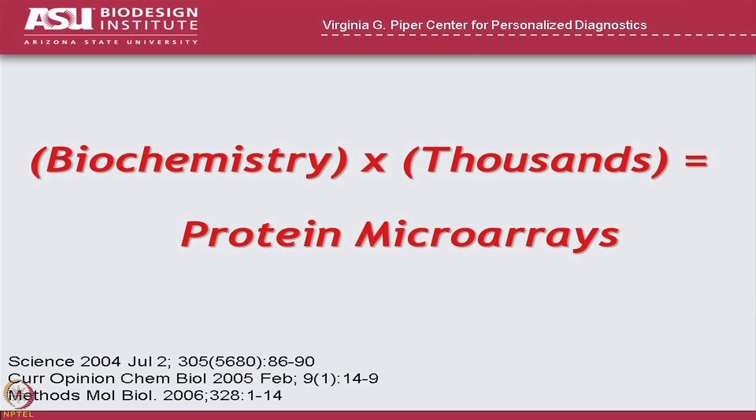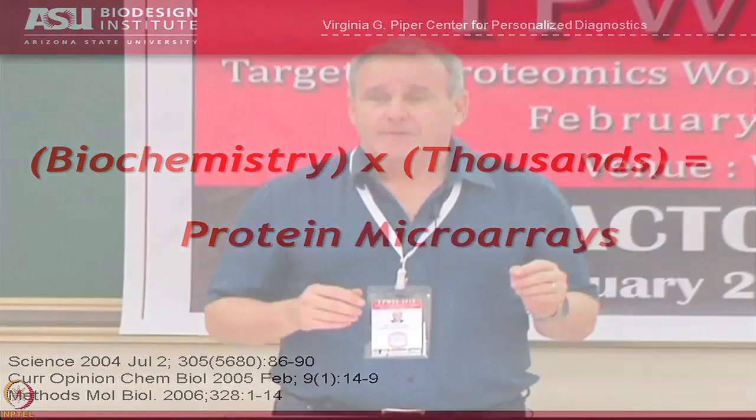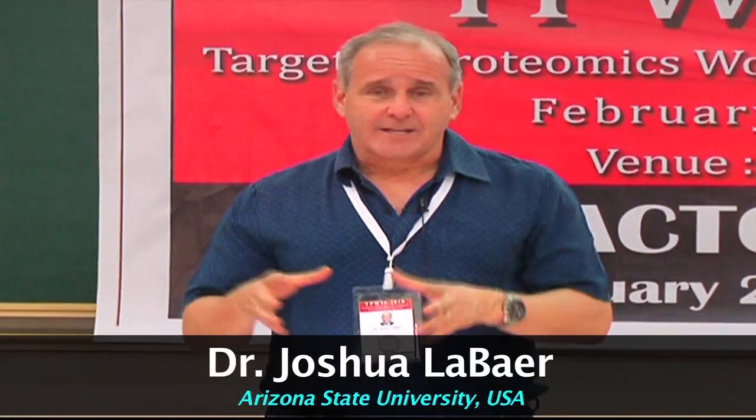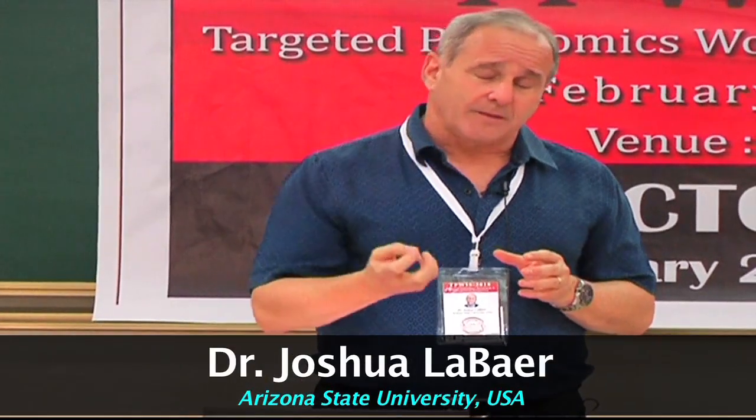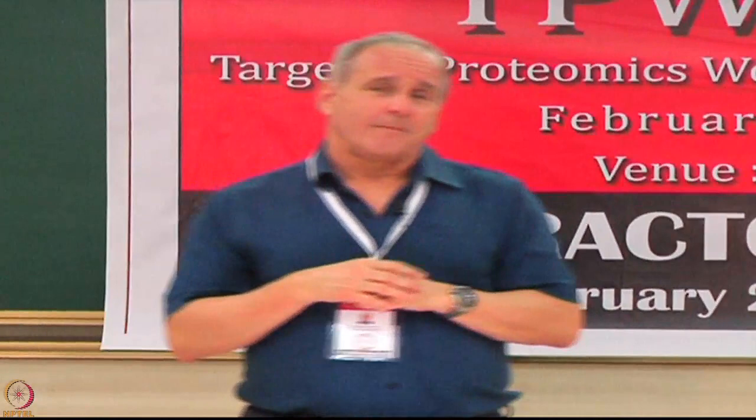And just to give you some perspective, when we first began this work, we actually started by trying to do high throughput protein purification. And so we were developing methods to make proteins in bacteria, lyse bacteria, capture the proteins on columns, elute the proteins, and then study them in high throughput. And believe it or not, we still do some of that work for other reasons. But we realized very quickly that it's hard to do high-throughput protein purification.